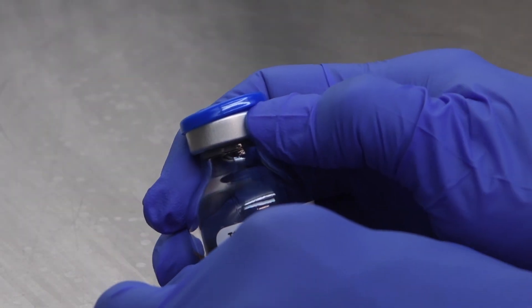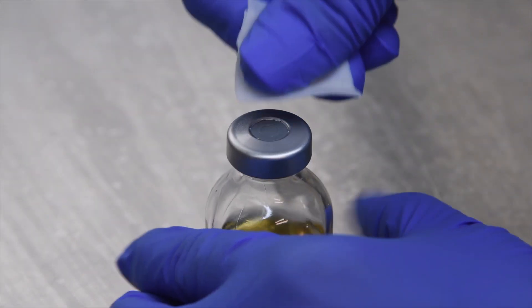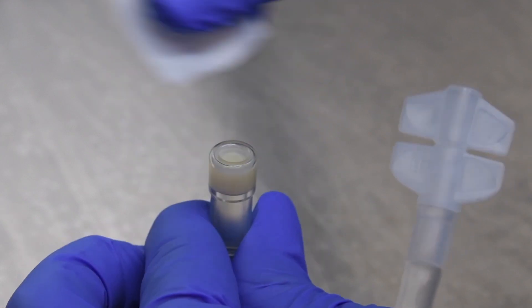Remove the tamper-evident seal cap from the serum vial. Clean the septum port of the serum vial and the 100 ml media bag with a sterile 70% isopropyl alcohol wipe.